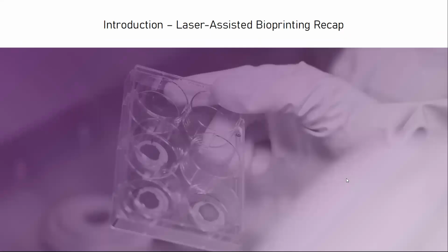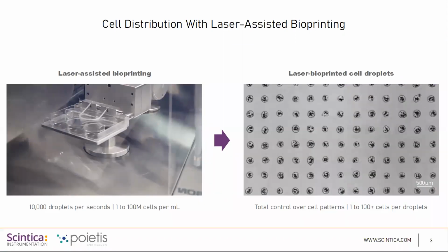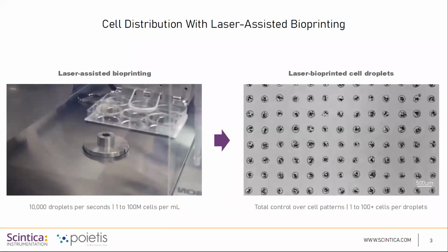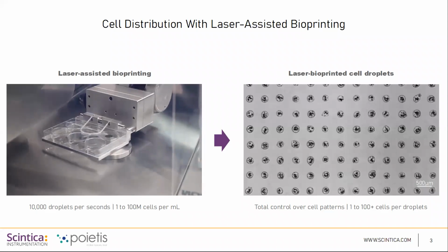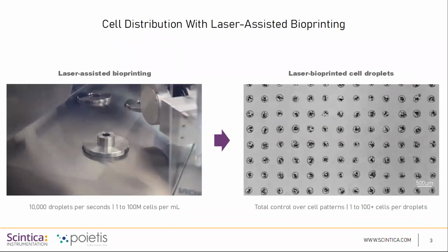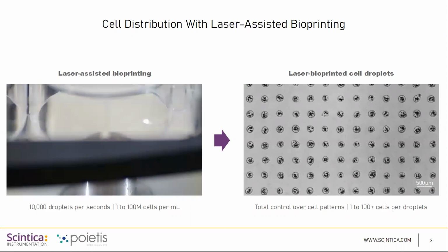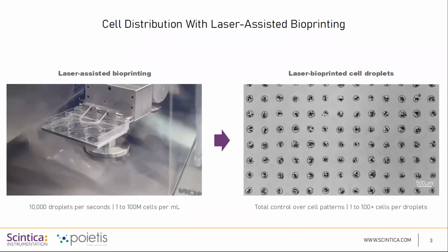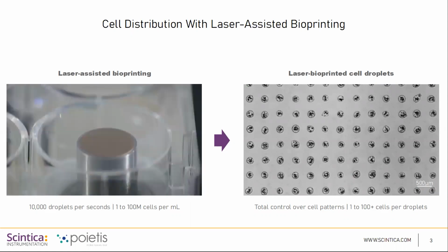Before we step into the demo, please allow me to give a quick recap of the laser-assisted bioprinting technology for those of you who did not attend the previous couple of sessions, since laser bioprinting really lies in the very core of the platform. Laser bioprinting is a unique nozzle-free technology that has the capacity to give the user full control over spatial distribution of cells in the bioprinted construct, thanks to customizable micro patterns in which cells are printed, literally in nanoseconds. So this droplet pattern approach has a genuine and direct impact over self-organization of cells, and hence biological functions emergence and proper tissue morphogenesis post-printing.